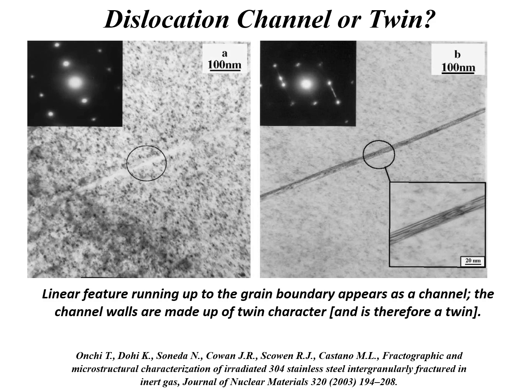And they were mistakenly identified as channels because channels involve clearing out of radiation damage, basically dislocation-free regions of the material. And it would appear like these bands are dislocation-free. It's not that they're dislocation-free, they just tilted to a different orientation. And you're not getting strong diffraction contrast, whereas in the matrix you do get stronger. It's not very good diffraction contrast, but it's stronger diffraction contrast. And really this difference between some contrast here and no contrast there is simply strong contrast there and no contrast there.